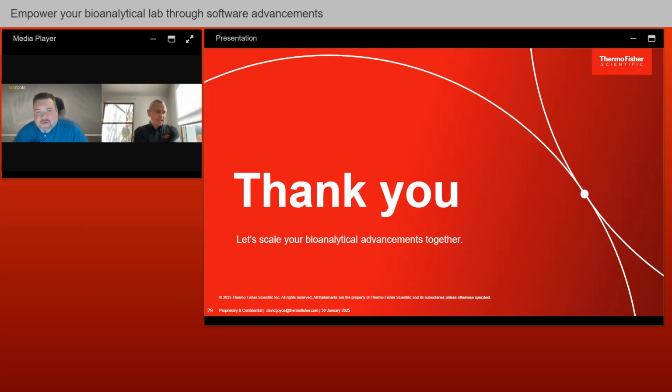Yes. So it's great that CDISC has been adopted by the industry. Again, I'm going back a long way, but it feels like recent memory for me, 15 years ago or something like that, where everything was sent as Word documents, and the data would be transcribed by the regulatory body from these documents, and they would then second guess and check the values. CDISC was a real revolution back in the day.